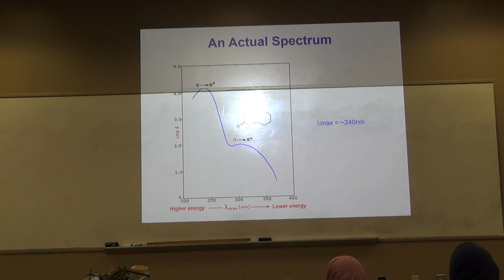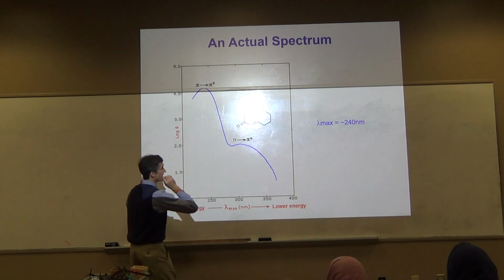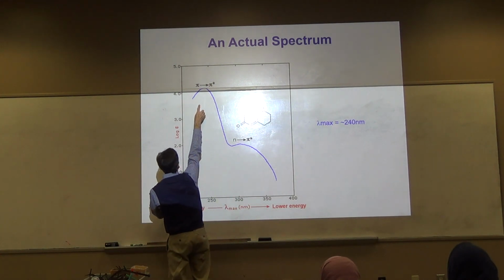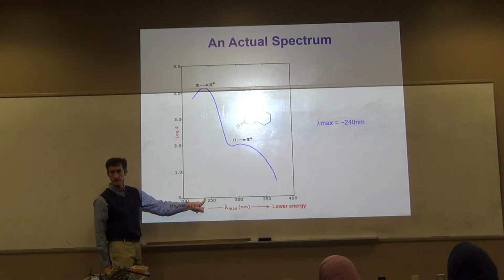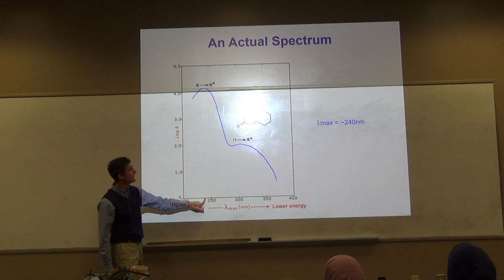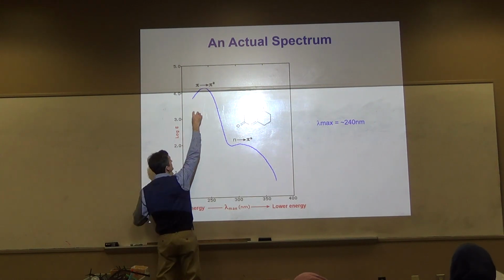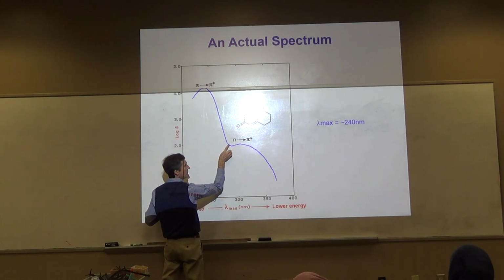Here's a UV-Vis spectrum of this molecule. Lambda max is what? Right here? About 240. Okay, that's how the lambda max came up. There's a high absorbance there that peaks out, and it's almost like something else is going on here, another little ridge.